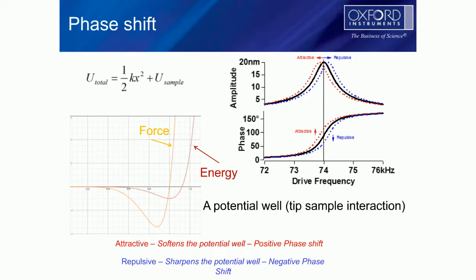As we move up the curve past the inflection point, I don't have a pointer, so I'm trying to describe it, we see an increase in the force to a repulsive force. We can imagine going back and forth across the x-axis on this, and that's our tapping. Depending on where your tapping occurs, whether it's below that zero line, above that zero line, or crossing that zero line. If it's crossing that zero line, that is mixed mode, and that's bad.